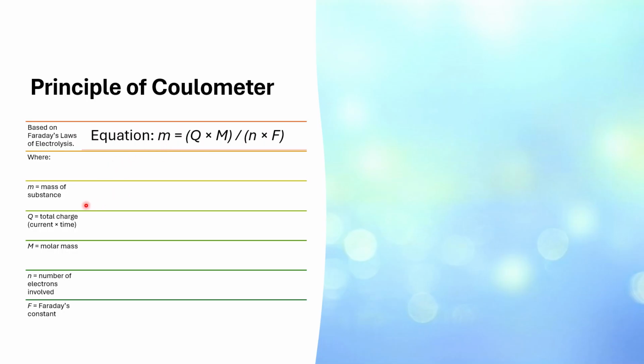substance that is deposited or consumed at the electrode, and Q is the total electric charge that passed through the solution, which is simply current multiplied by time.